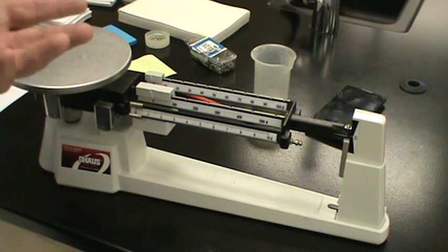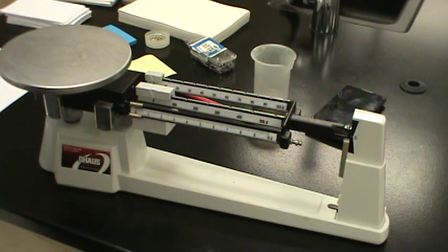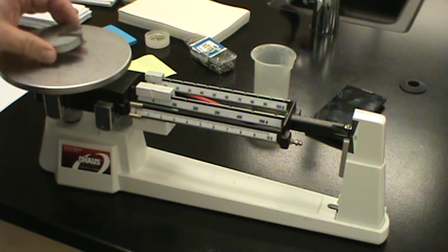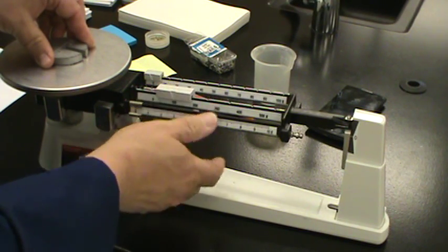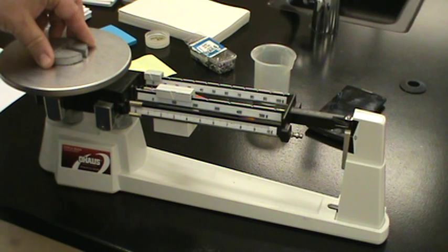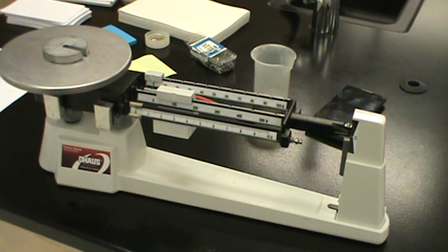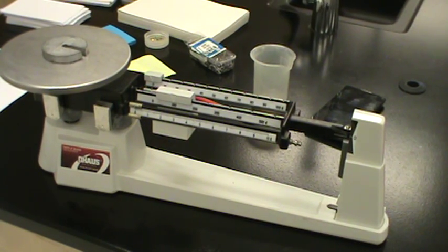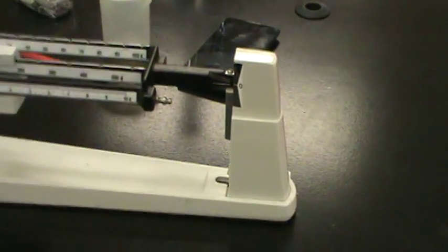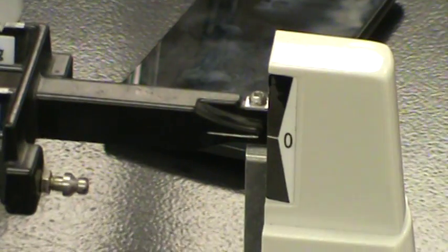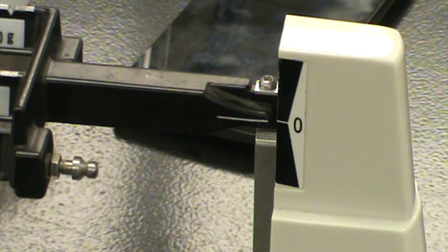But now let's go back to what we were saying. I have a known mass, in this case 100 grams. I'm going to set it right in the middle of our stage or platform here. I'm going to move this counterweight out to 100. I'm going to line it up with 100. And then I'm going to just release it, and we're going to see if it does indeed line up. And in our case, let me see if I can get you turned around here so you can see this. It does indeed weigh 100 grams here on Earth.